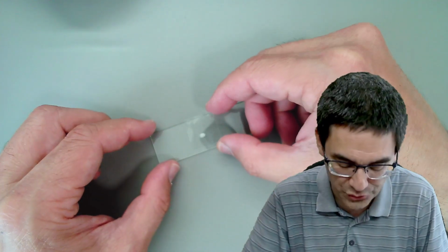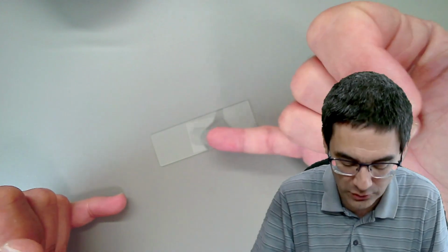Let's move my yogurt away. Cover glass goes on top. And look how it spreads. And you know what I'm going to do is I'm going to press even further against it to really make it flat and thin.